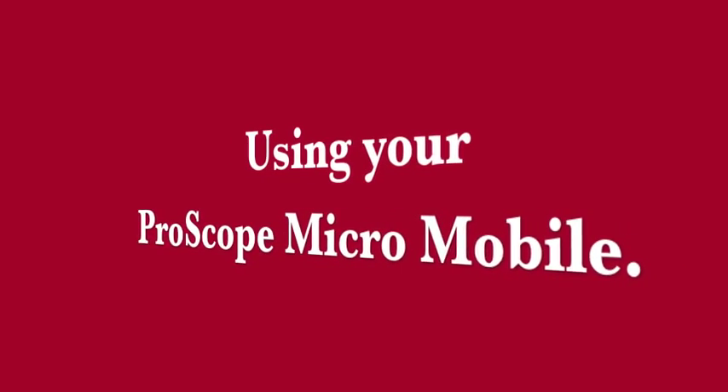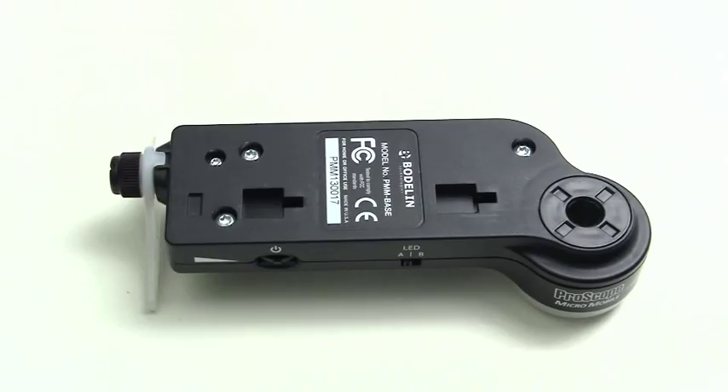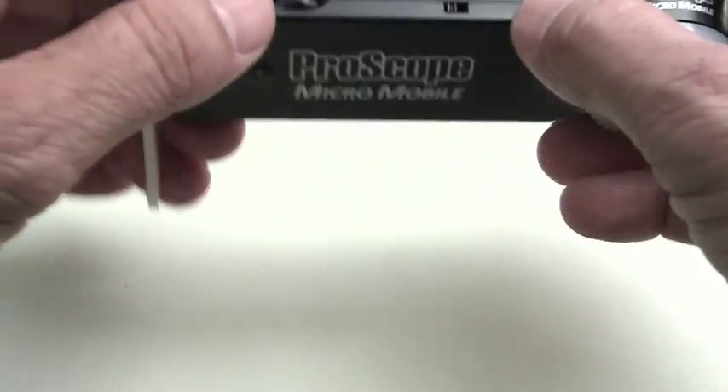Using your new ProScope MicroMobile is as easy as using your iPhone or iPad. First of all, let's look at the ProScope MicroMobile base unit.